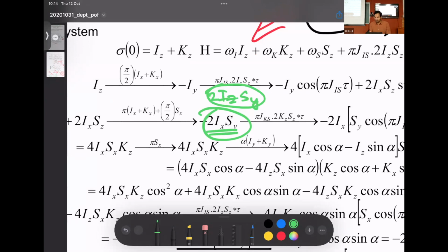Why do I say the lines will be slightly broader? Because both are transverse, while here one is longitudinal and the other is transverse. So the relaxation phenomenon will be slightly different. If you overlay the carbon 1D on the DEPT, the lines will be slightly broader. That's a different consequence, one that comes because both I and S are transverse. You guys follow what I'm saying?